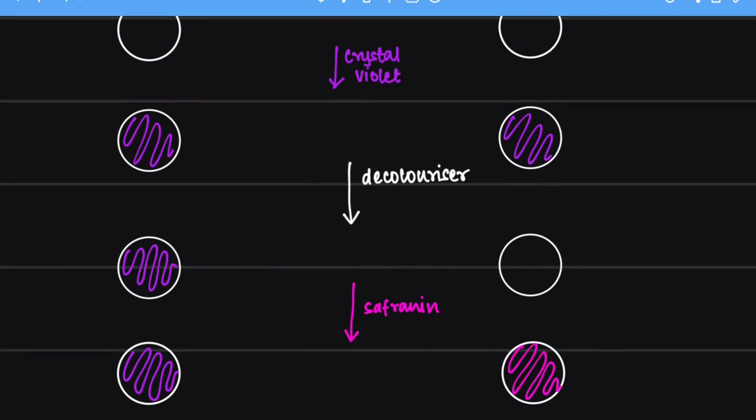Under the microscope, what we are going to find is that the gram positive bacteria is going to look purple and the gram negative bacteria is going to look pink.